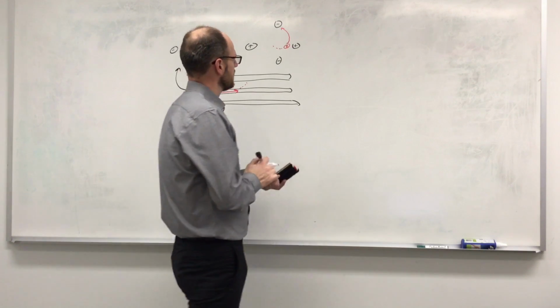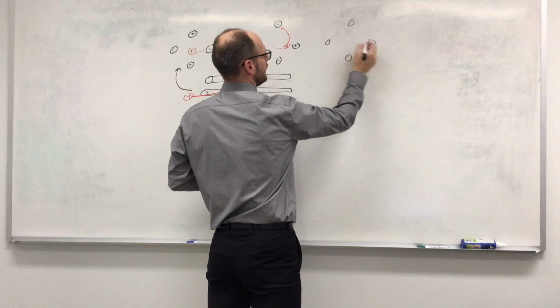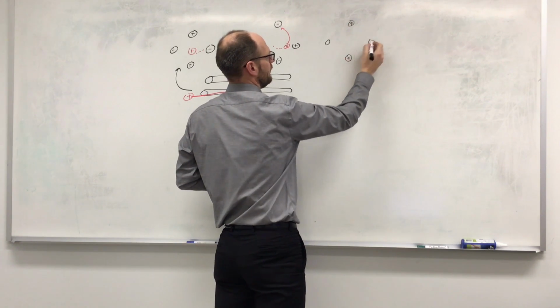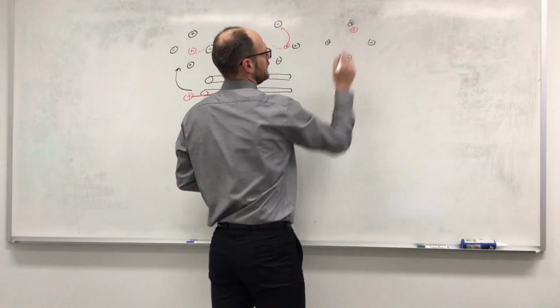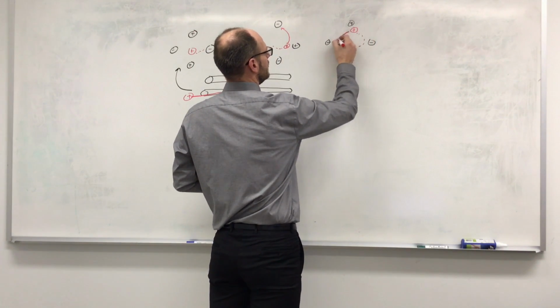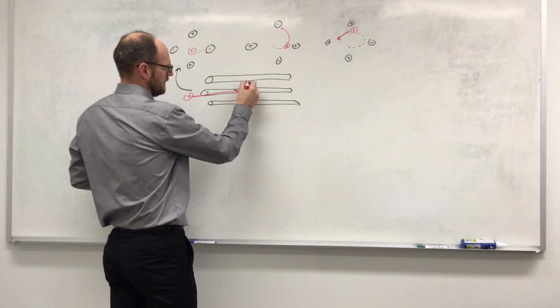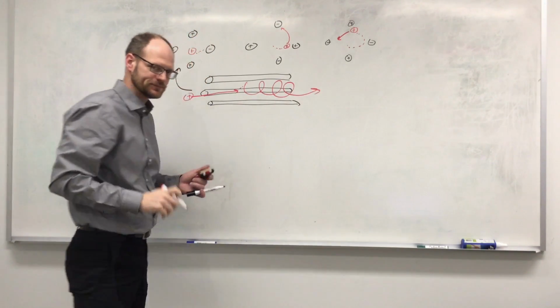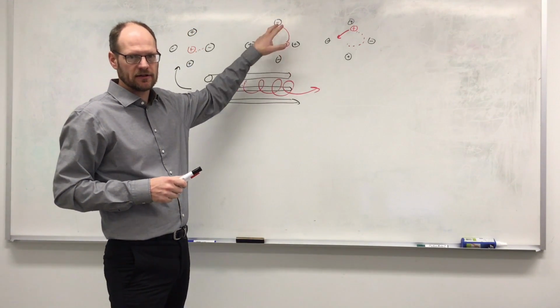Well, after another unit of time, the instrument switches polarity again. And so after it switches back again, the ion finds itself right next to this rod, which is repelled again. And so it starts flying off towards the next rod. And so the net effect is that this particle will end up gyrating down this instrument all the way out. Okay? All right, so why do ions respond to changes in the electric field?